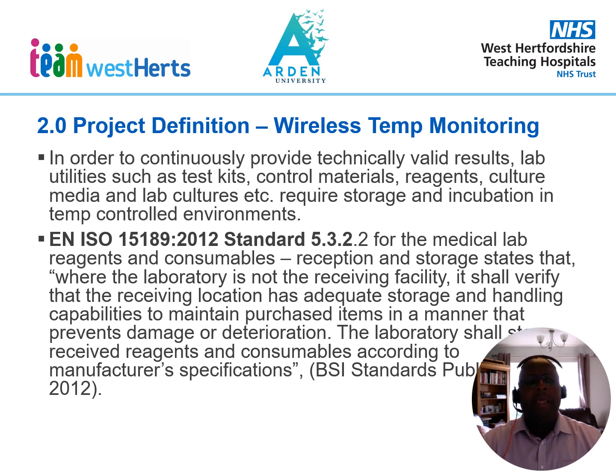By implementing a wireless temperature monitoring system, it will enable the laboratory to comply with EN ISO 15189 2012 standard 5.3.2.2 for medical laboratory reagents and consumables.